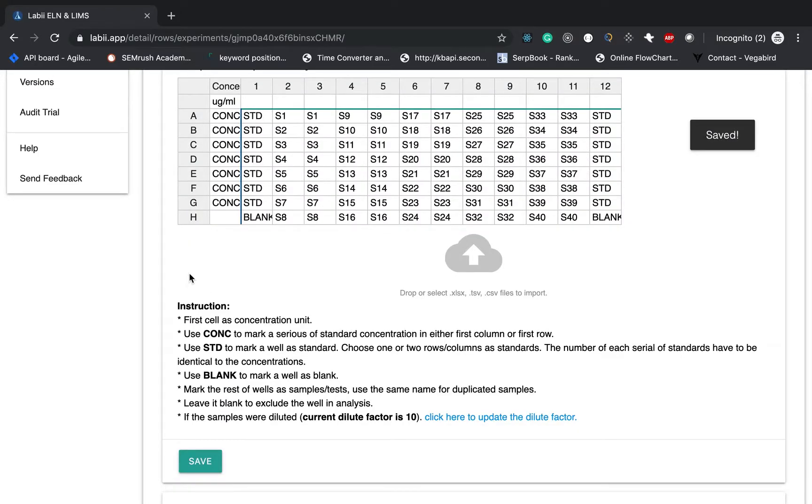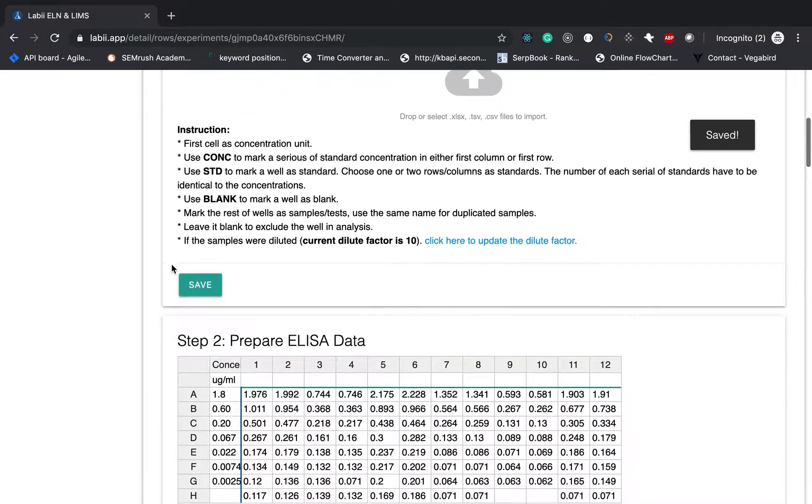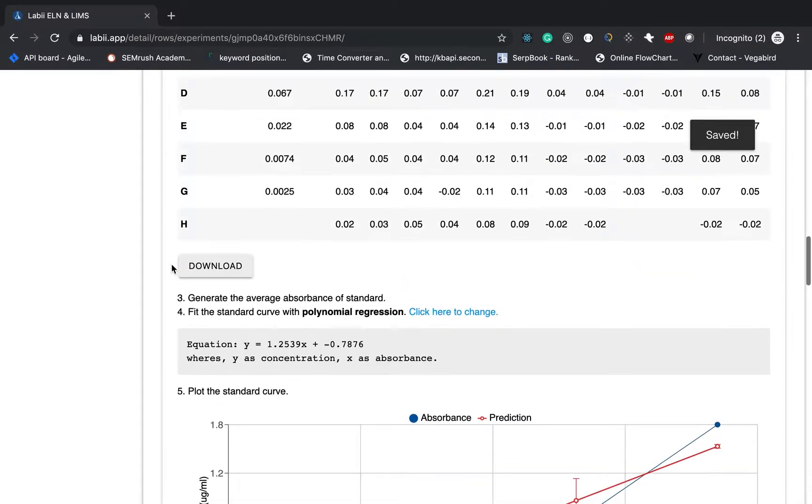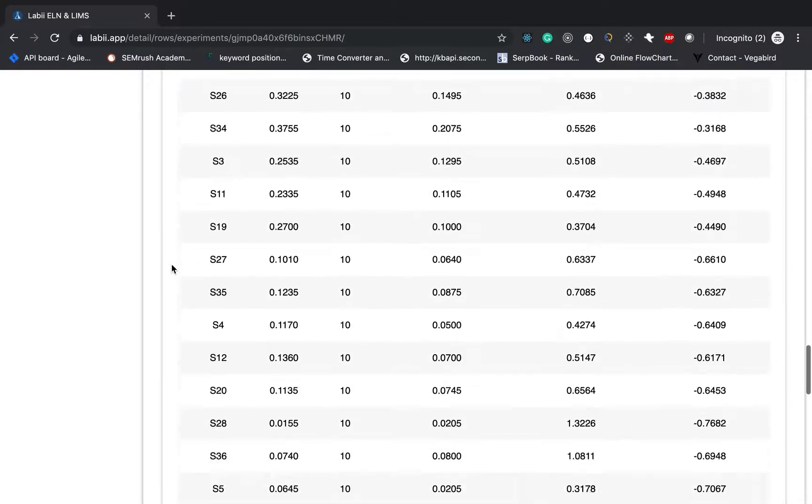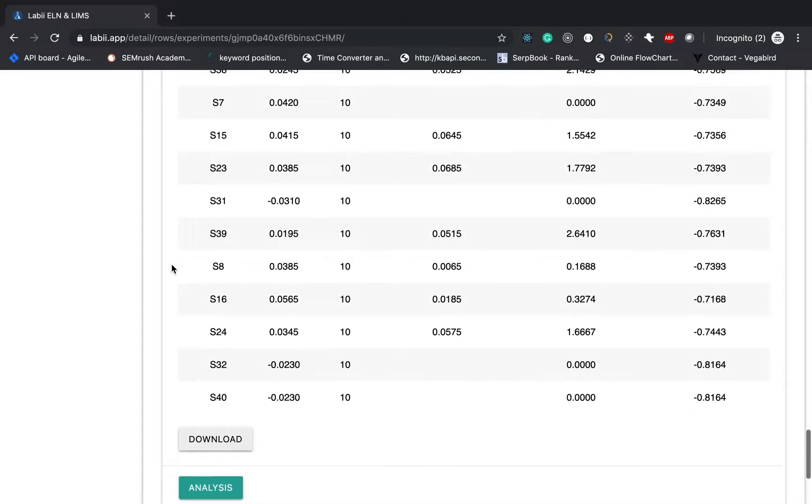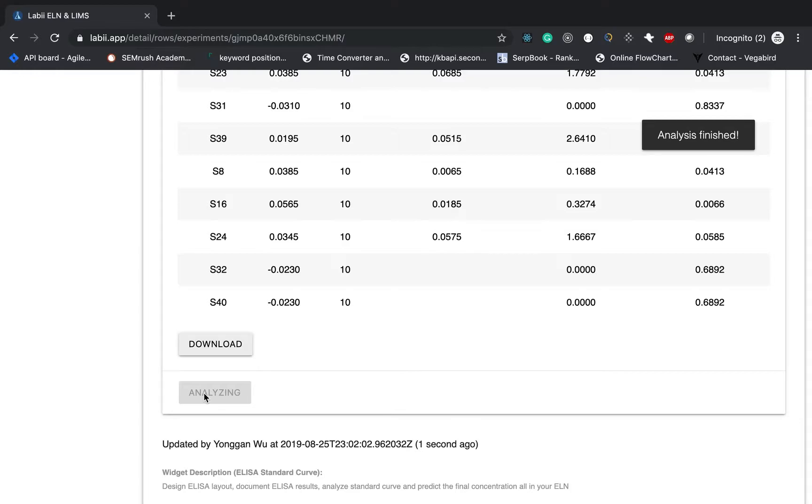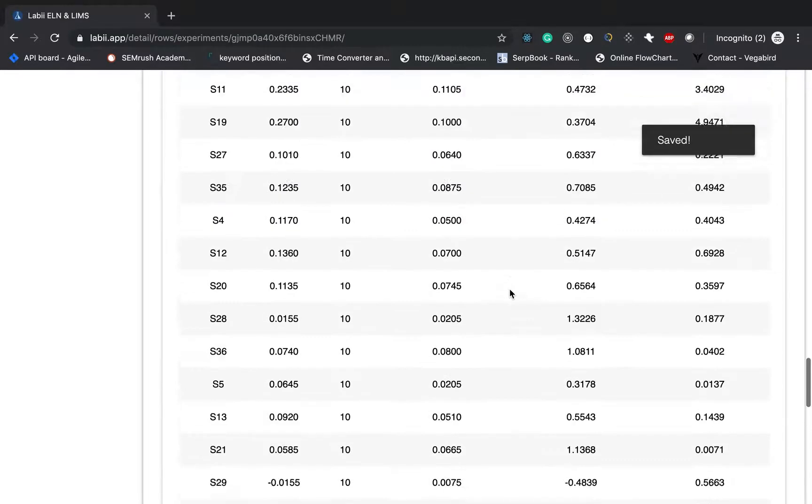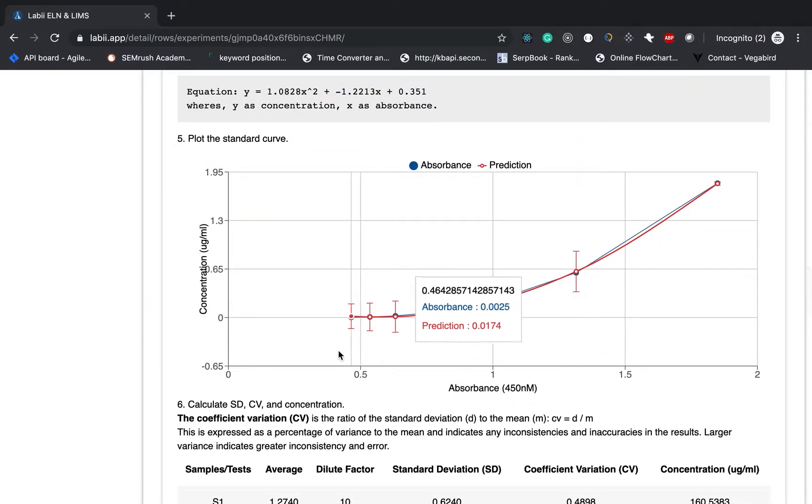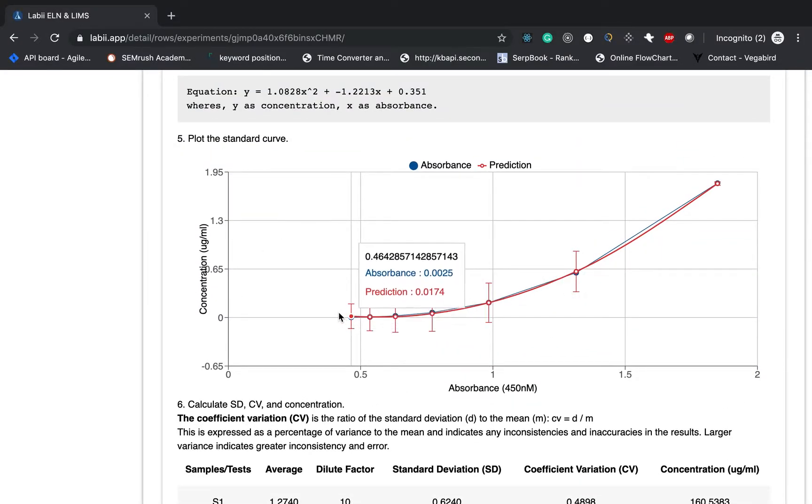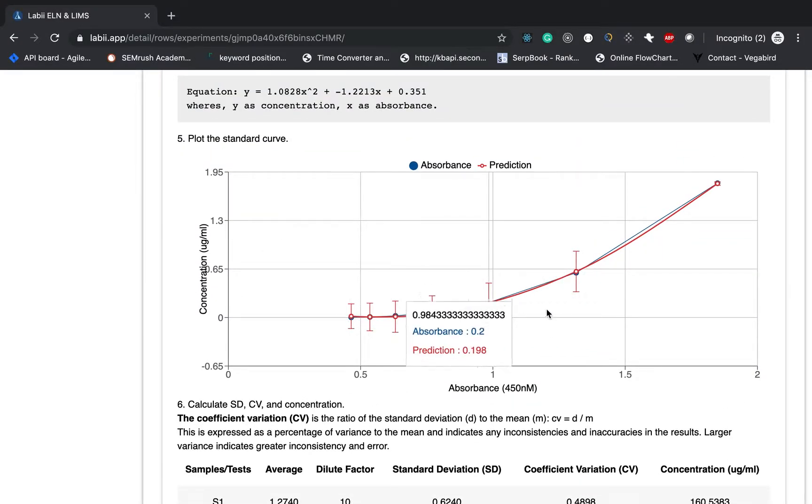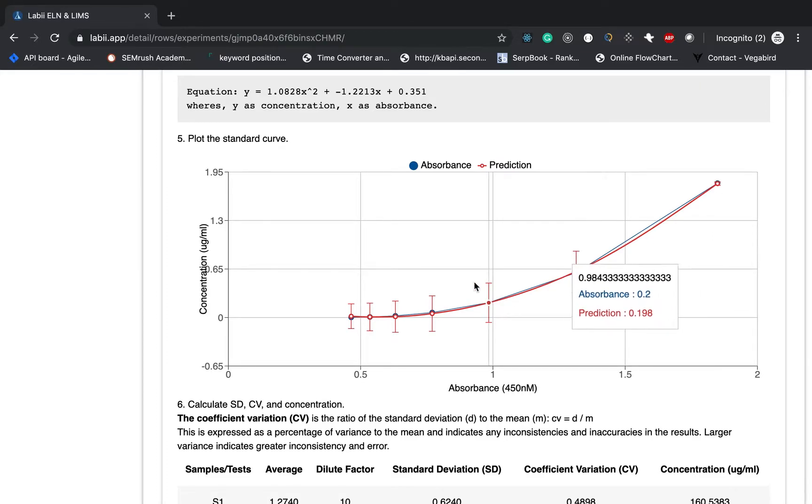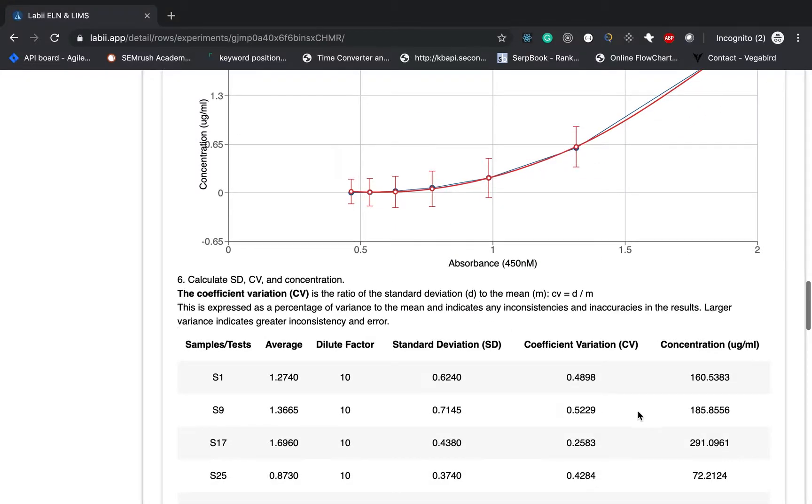To update the final analysis result, you need to click the analysis button again. So just simply going back and click analysis. It will do all the analysis again. And then analysis is finished in one or two seconds. And you will notice the standard curve is fit to the standard very well. And then at the same time, it also gives you the standard error. And then the concentration is being multiplied by the dilution factor.